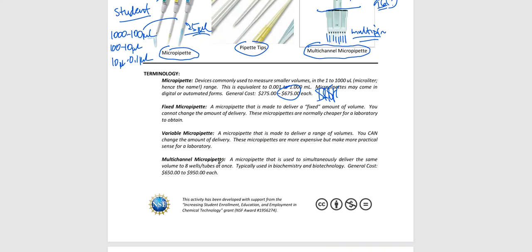Micropipettes, again, they are made by different manufacturers. The ones that you'll use today are made by a company called Ward's, and Ward's Scientific is just a scientific supplier. Fisher makes them. VWR makes them. A company called Edvotech makes them. We really do like those. BioHit makes them. So the list just goes on and on about the different manufacturers or the different brands of micropipetters that are out there.